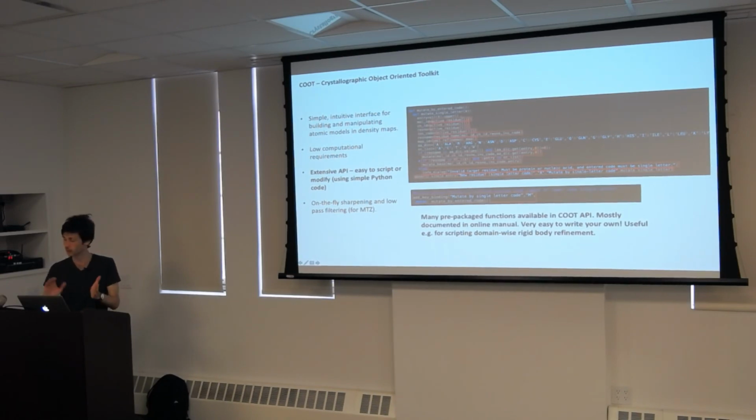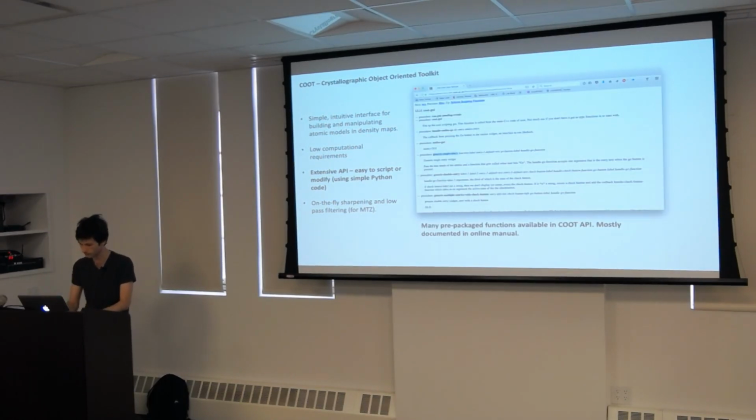Definitions of the active residue where the cursor is, definitions of mutating a protein residue, mutating a nucleic acid, easily bringing up a dialog for user input, all of these such things. Super, super easy. And then you can just tie it to a keyboard binding really easily, so you've got it there to use. All right.